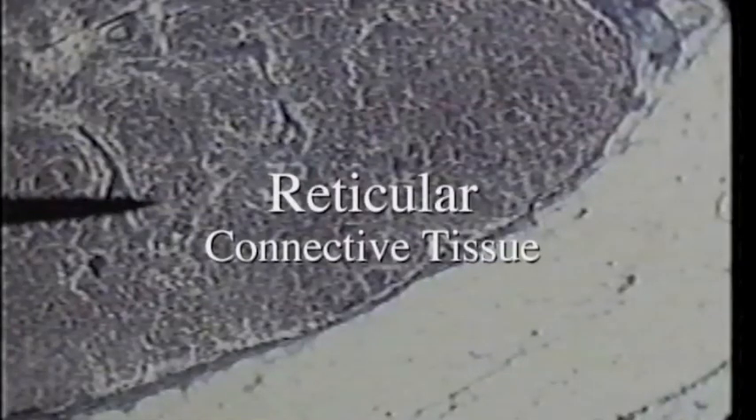Here on low power we see a slide of the lymph node. The lymph node's framework is made up of reticular connective tissue. Not a whole lot is visible here. Up toward the top you get a sense of some bluish purple fibers. We'll go to high power where we can see the fibers and the cells more clearly next.